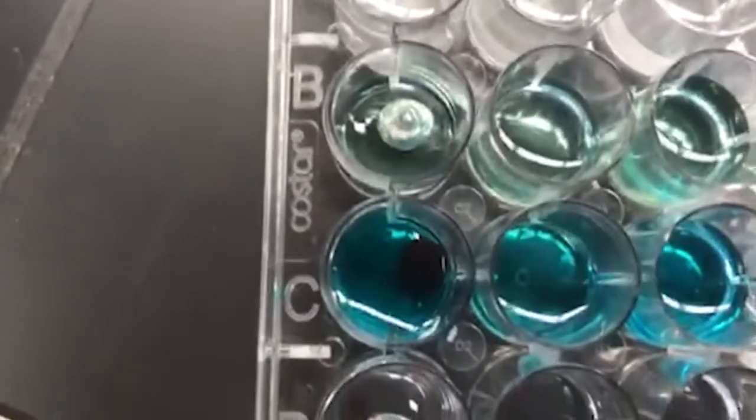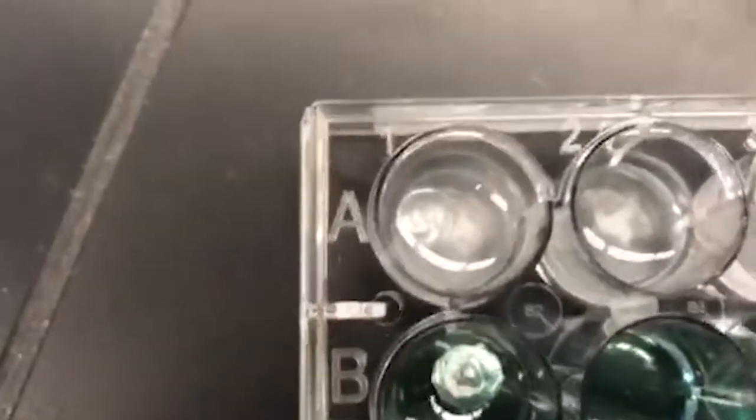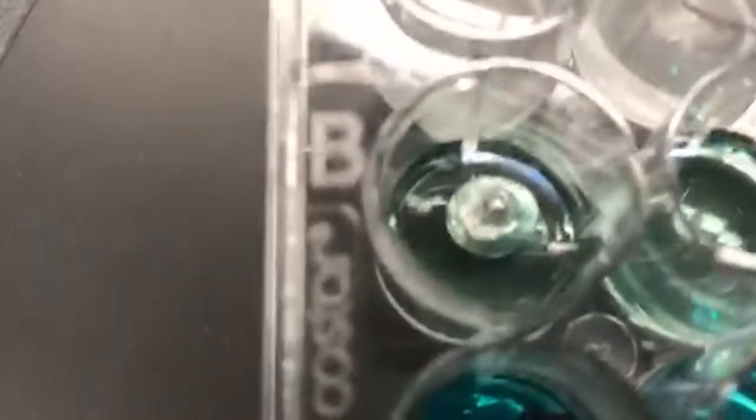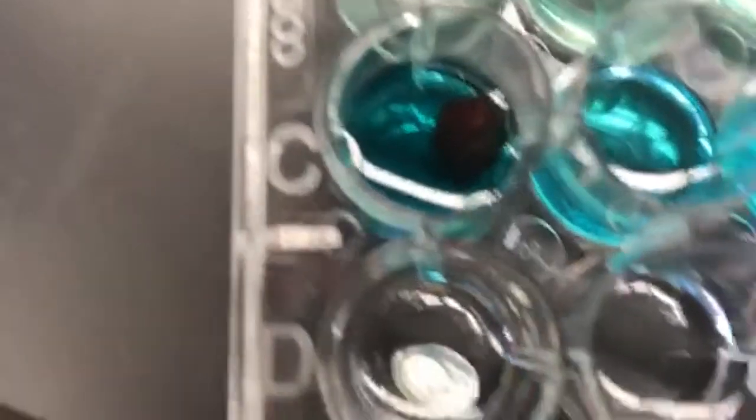Oh wow, look at that. Immediately, something happens whenever I put it into the copper solution. Okay, now let's take a quick glance at everything else. Nothing really appearing to happen there, but that's definitely something.